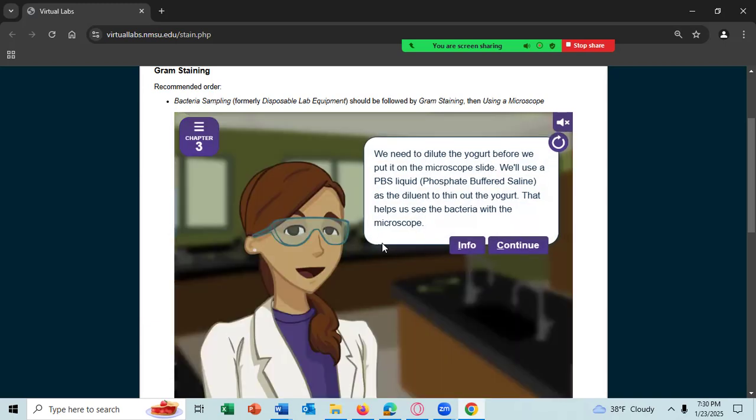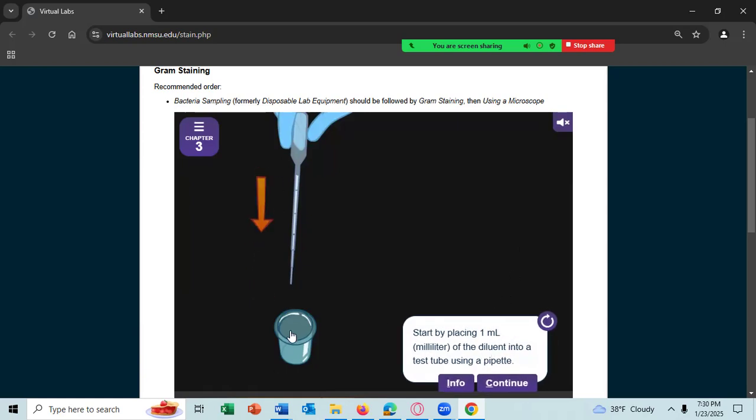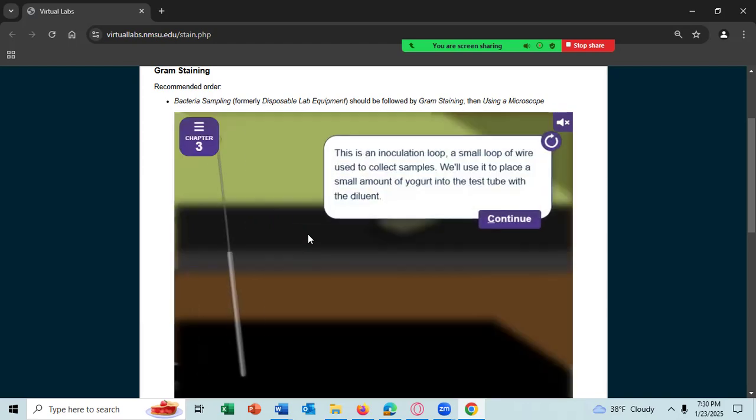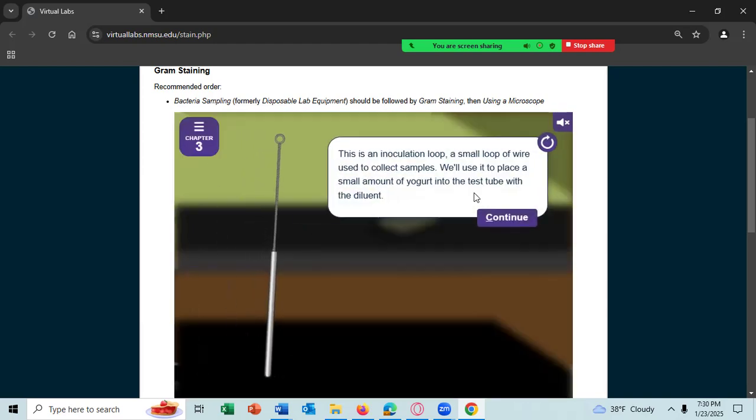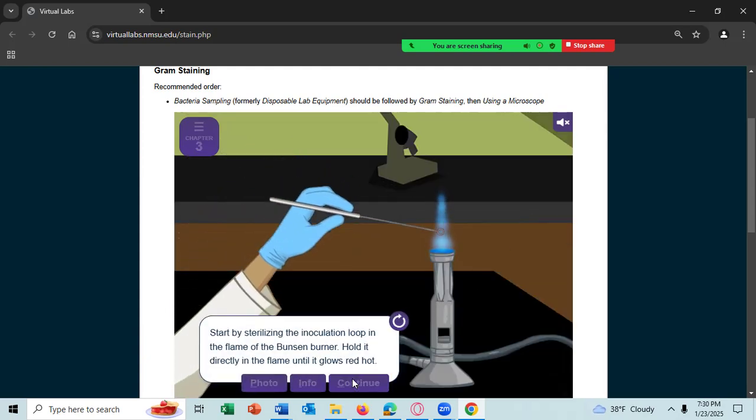And that's how you light the Bunsen burner in the virtual lab. Once again, follow the arrow. So you take this and go down. And that's the first time. Oh, I thought that one took more than one, but apparently it only took one. Just trying to speed up.